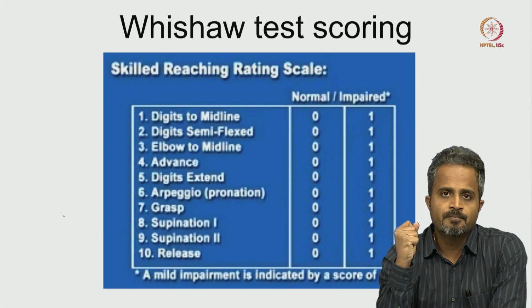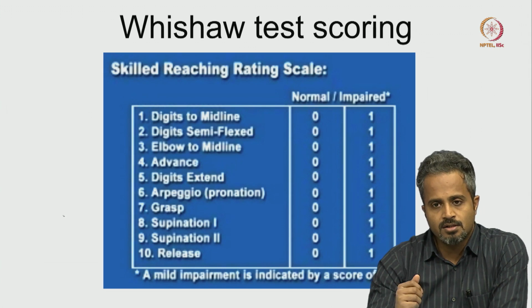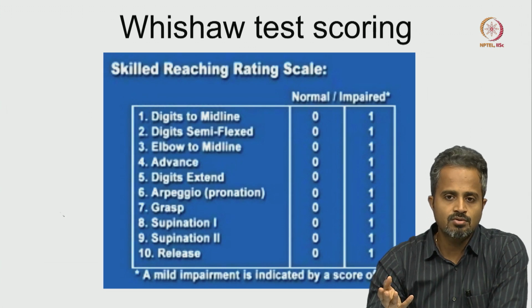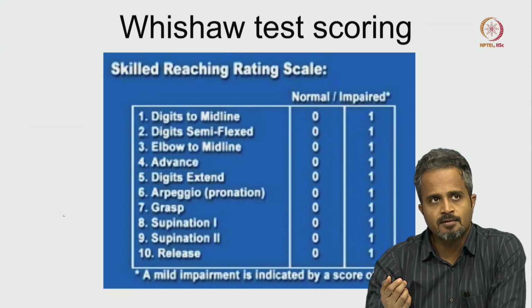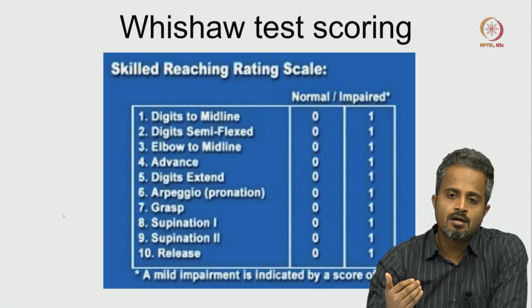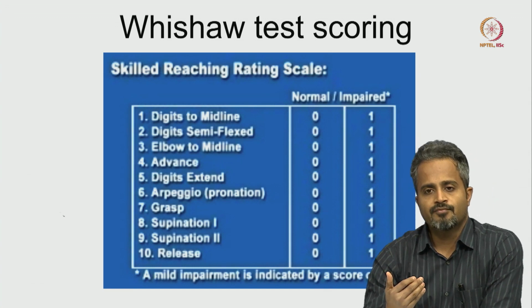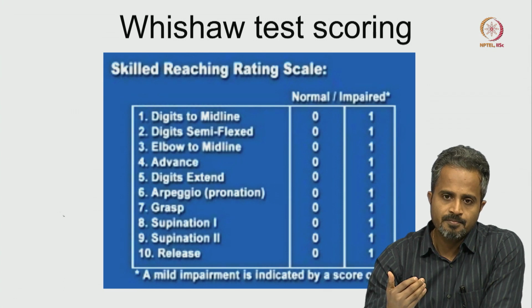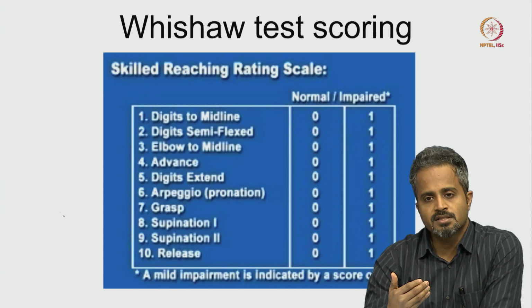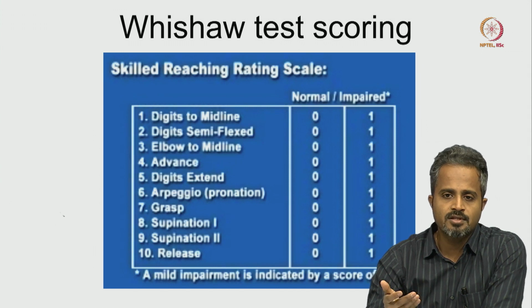For example, you may think the stroke will cause hemiparesis or hemiplegia, so it is really easy. But if your stroke surgery is suboptimal, and the rat is still able to reach the food pellet and the task itself becomes a success, then you would wonder, is there any real difference before the stroke and after the stroke?